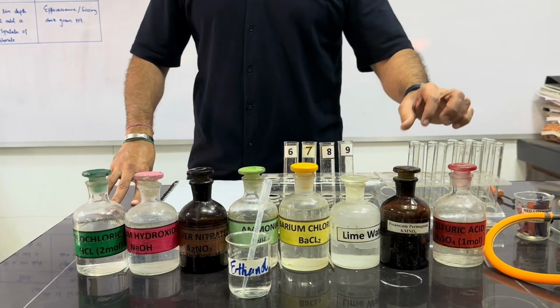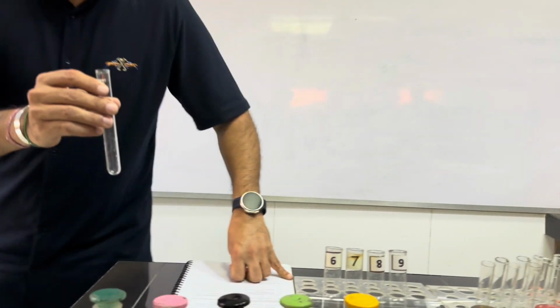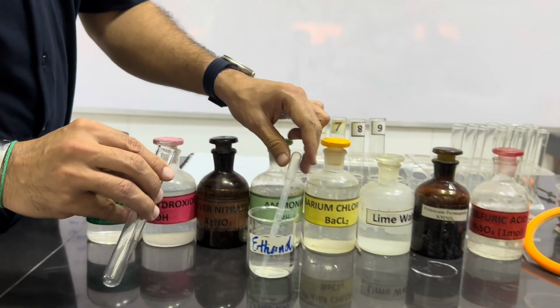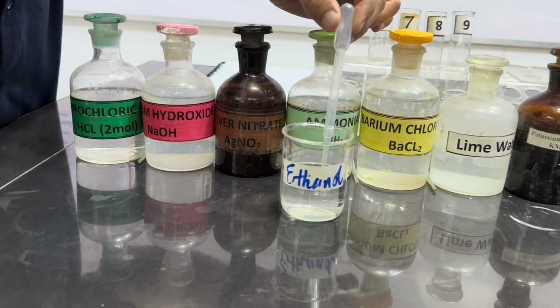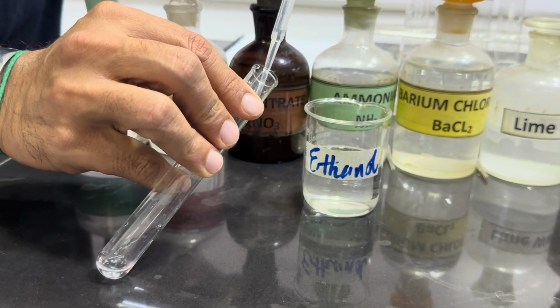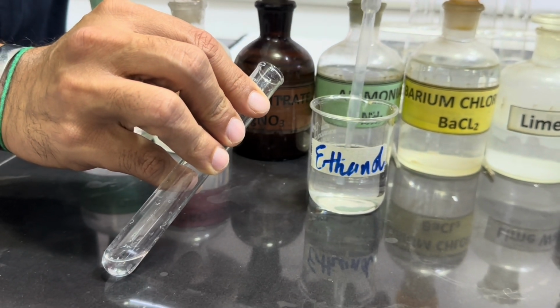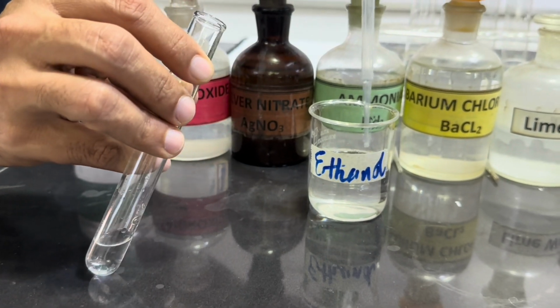Now we will take a test tube in which we will add 1 centimeter of ethanol first. So it's the ethanol solution, and we will add 1 centimeter of this in a test tube, and here it is approximately 1 centimeter solution of ethanol.